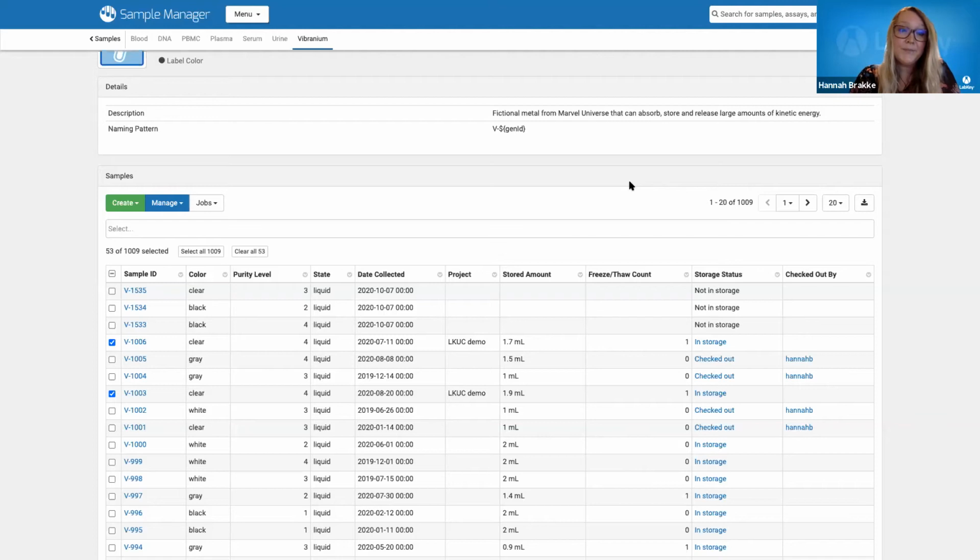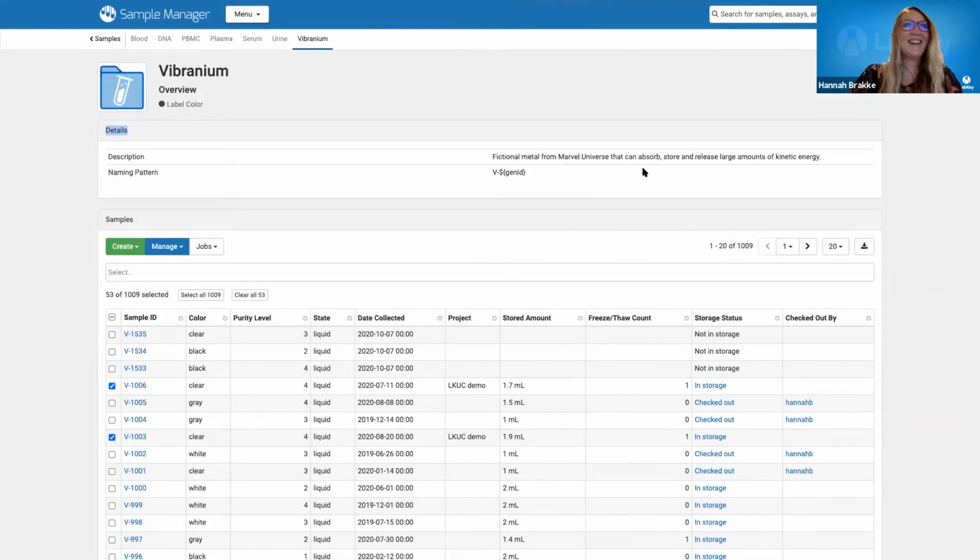Okay. And we have two more questions. We have time. Where are the help docs for LabKey for Sample Manager located? It is in, we'll see if I can smoothly transition. For some reason, it's not letting me transition out of this. But it is in our documentation tree.